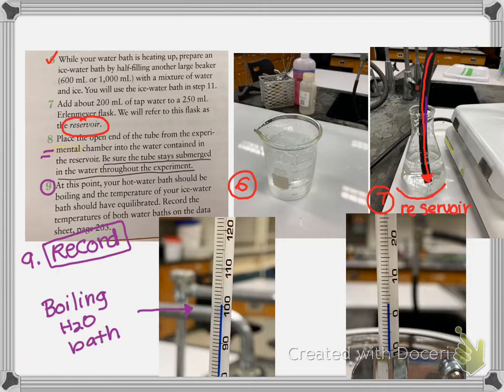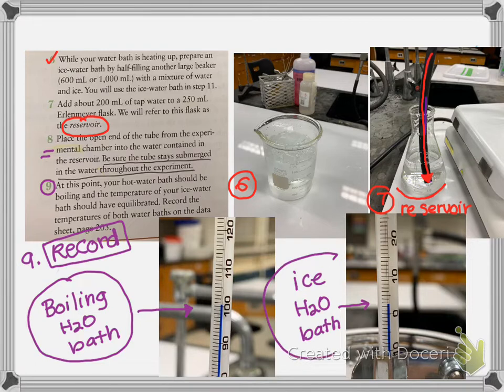So record that temperature, and this shows the ice water bath. Now our thermometers, the lines are 1 degree, and so you'll estimate to the tenths place. So you should have one decimal, like 85.3, 1 in the hundredths place, 1 decimal. Okay, so now you should have 2 numbers, the first 2 numbers in your data. Our thermometers are degrees Celsius.